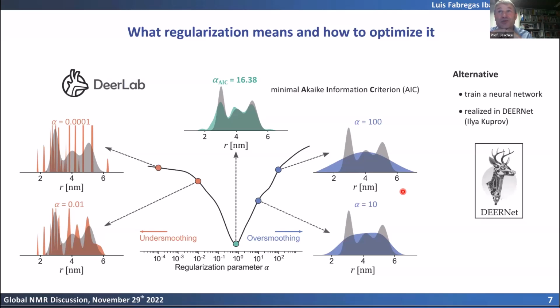Each protein is an individual. It's not so much the manual work of making additional mutants. You have to optimize the protocols. You have to be careful to check that everything is okay. This is not so easy to automate. So in the end, you need someone who makes the mutants, checks the mutants, makes the protein, makes the spin labeling, and this takes time.